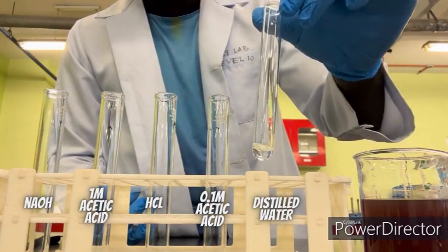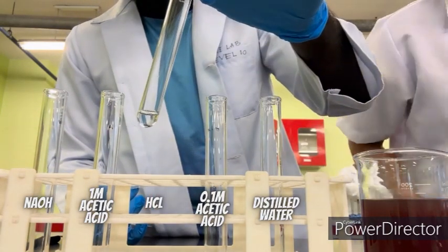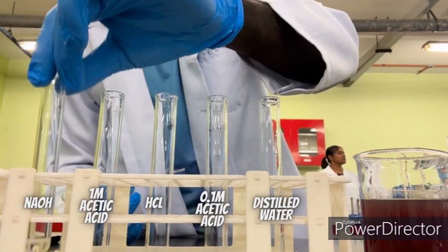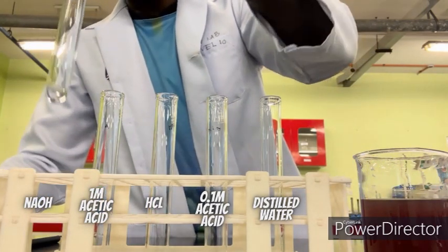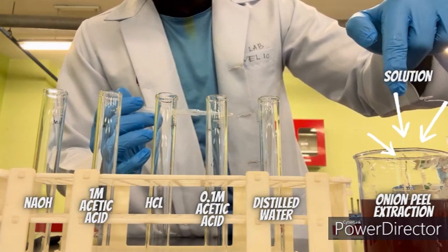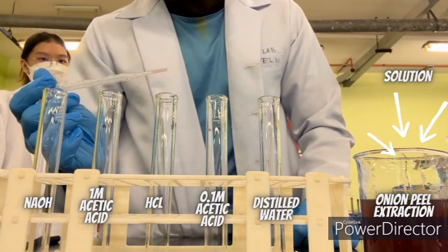This one is distilled water, 0.1 M acetic acid, this one is HCl, this one is 1 M acetic acid, and this one is NaOH. I'm going to add a few drops of our onion peel extraction to these chemicals, and we're going to see what reaction happens.